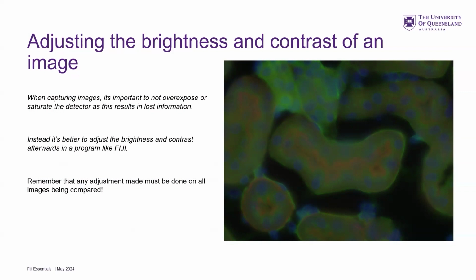So when we make the adjustments on images, it's important that we make the same adjustments on all images, because you can't just say, oh, look, my control's brighter than my treatment. Hooray, it worked. That's fraud.